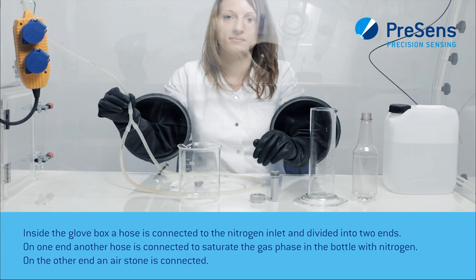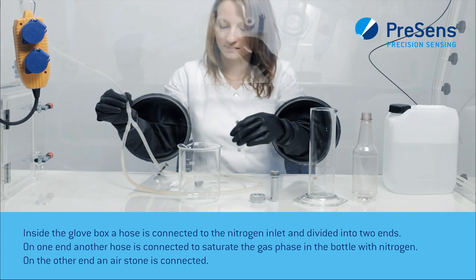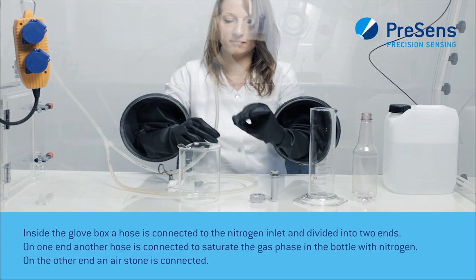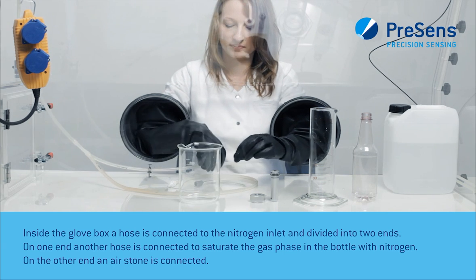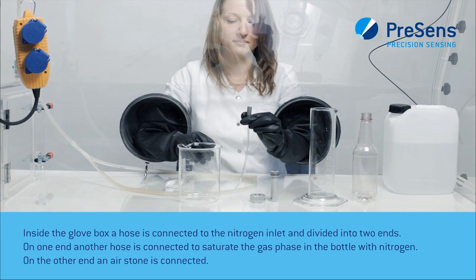Inside the glove box, a hose is connected to the nitrogen inlet and divided into two ends. On one end, another hose is connected to saturate the gas phase in the bottle with nitrogen. On the other end, an air stone is connected.